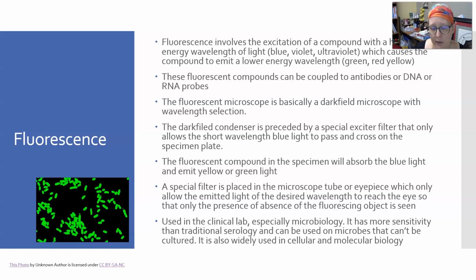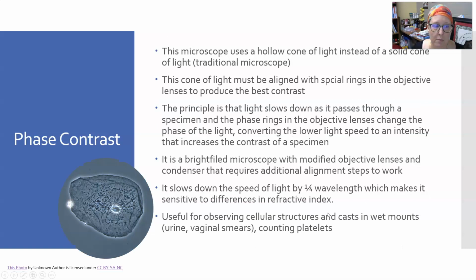So this is used in the clinical lab, especially in microbiology. Fluorescence staining techniques do have more sensitivity than traditional serology and can be used on microbes that can't be cultured also, so that's really nice. And it's also widely used in cellular and molecular biology.